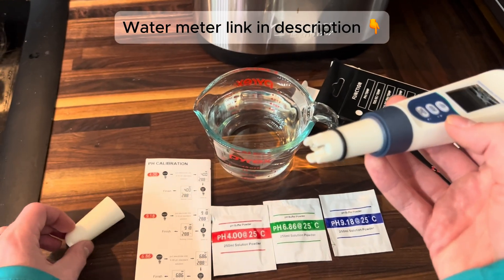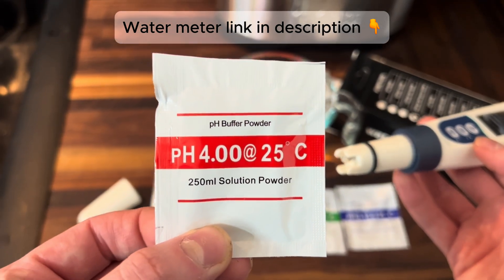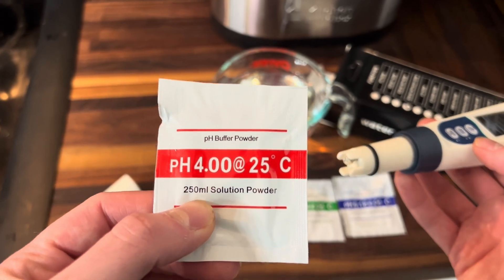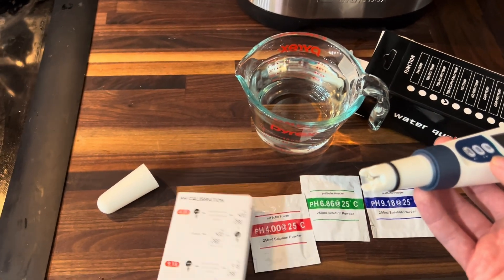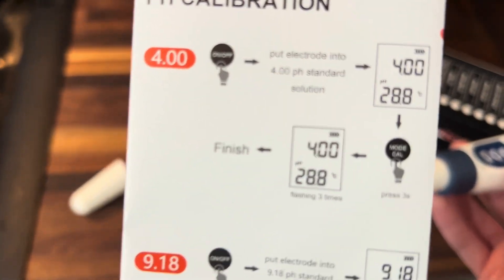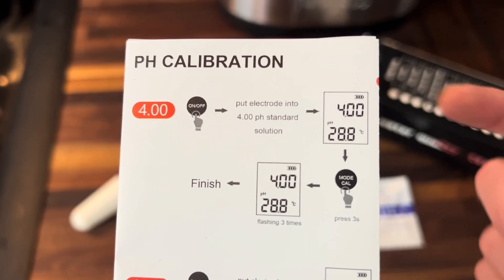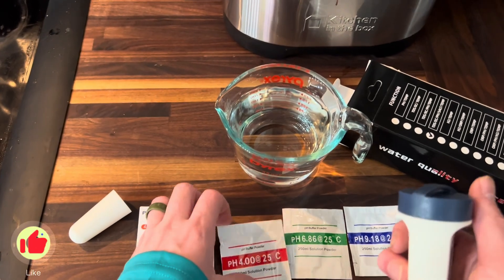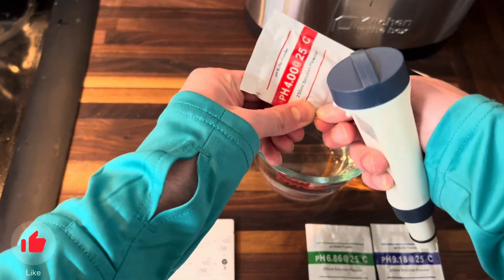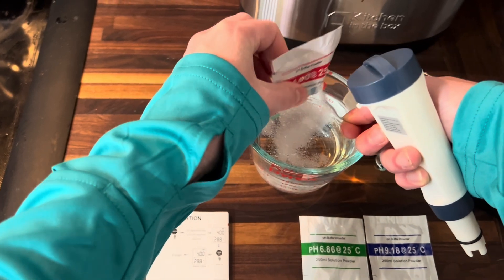We're going to remove that cap, and then the very first thing we need is this pH buffer powder. We need 250 milliliters of water and then we're going to pour that in. The instructions are very clear on how to actually calibrate this — super simple, basic step-by-step instructions. So let's go ahead and put in our 4.0 pH solution into our 250 milliliter water and let that mix in.